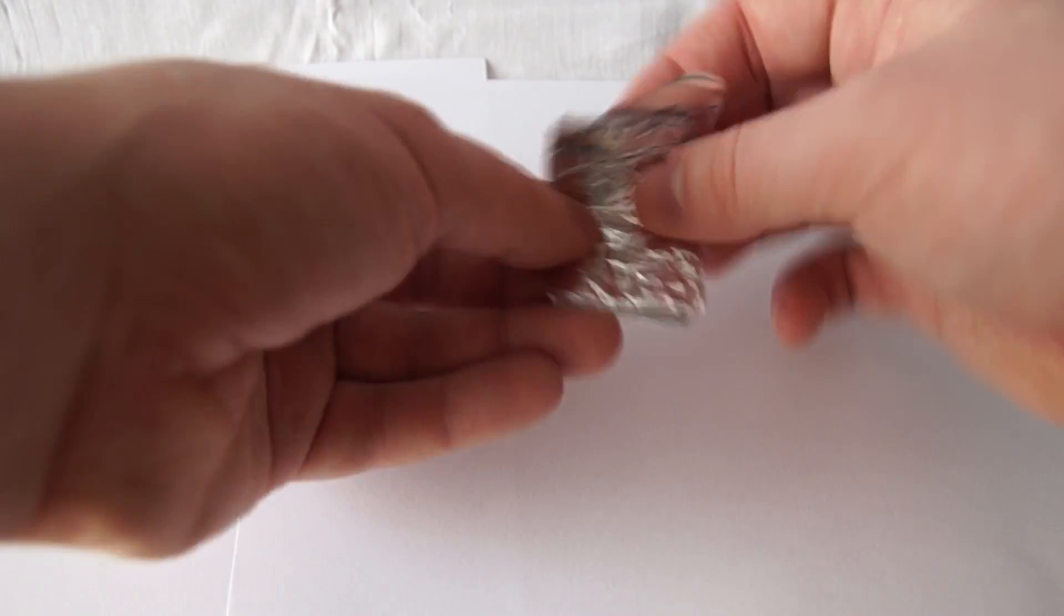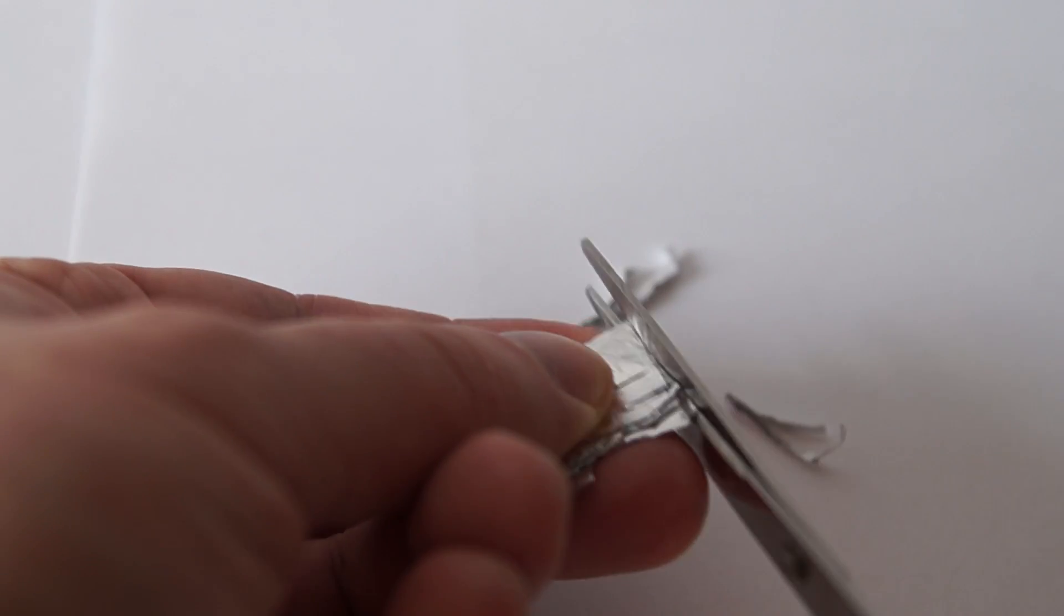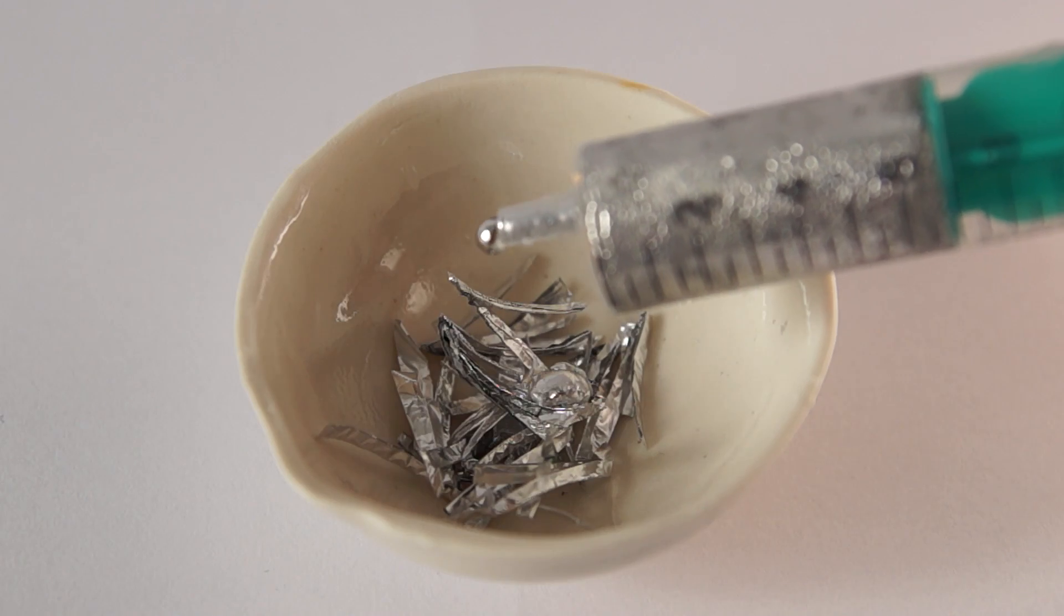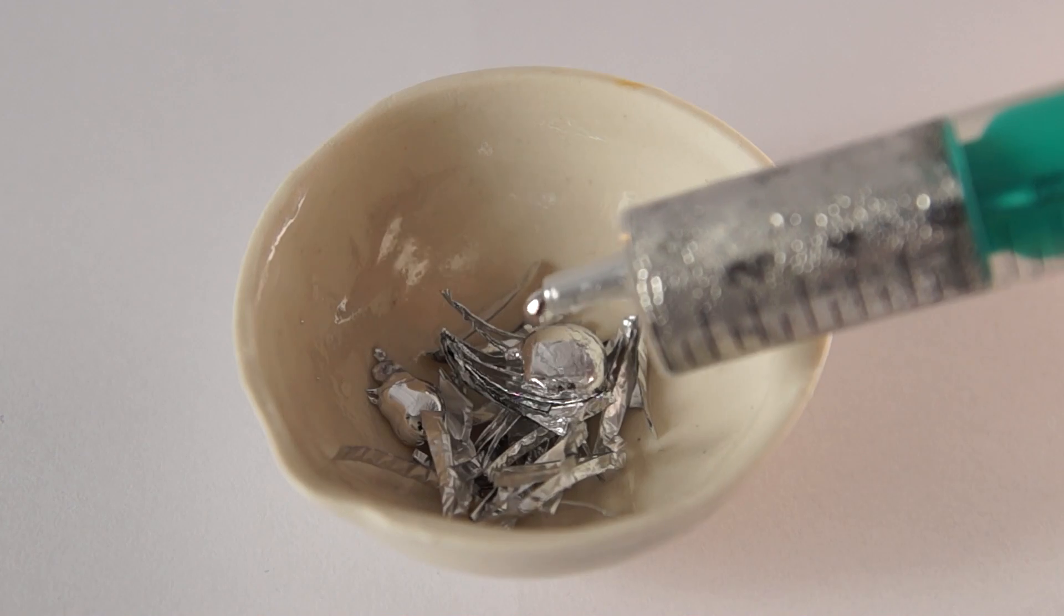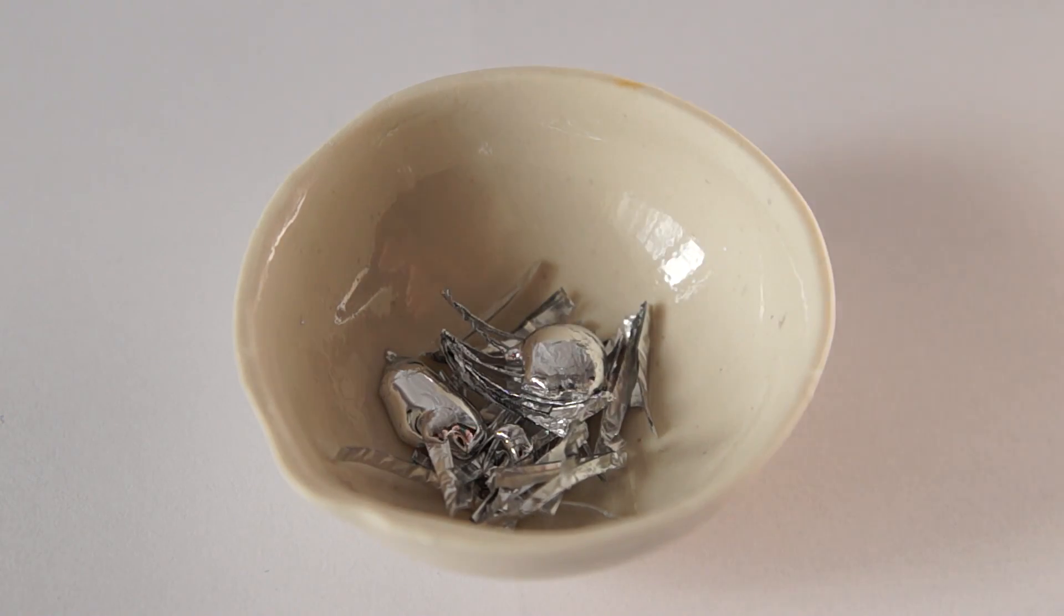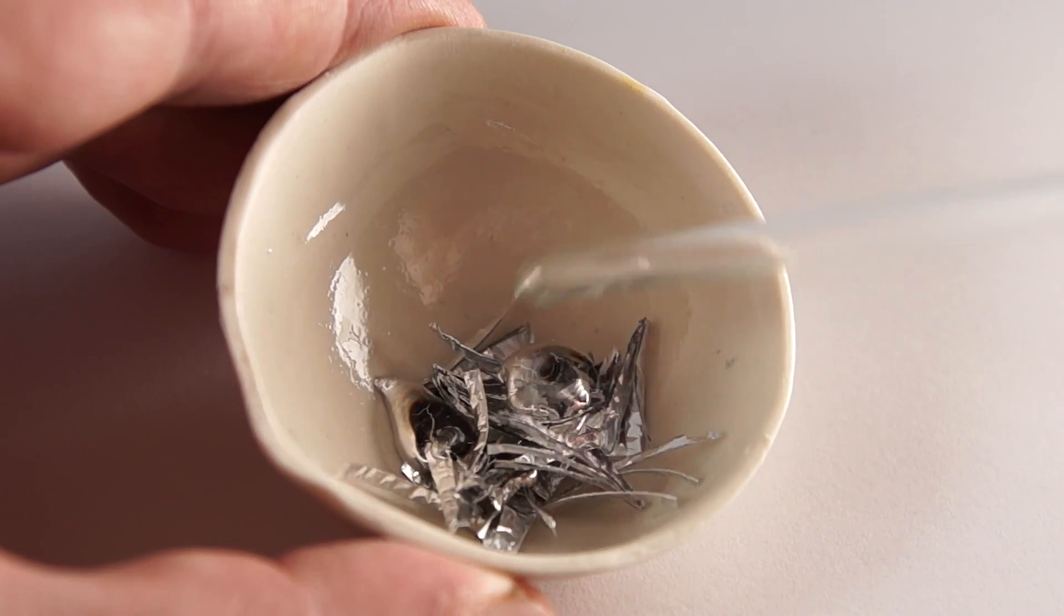Now let's conduct another experiment. Take an aluminum foil and fold it several times. Next, we need to cut it into small pieces and add a few drops of liquid gallium to these pieces. Now let's start making aluminum and gallium alloy by stirring them.